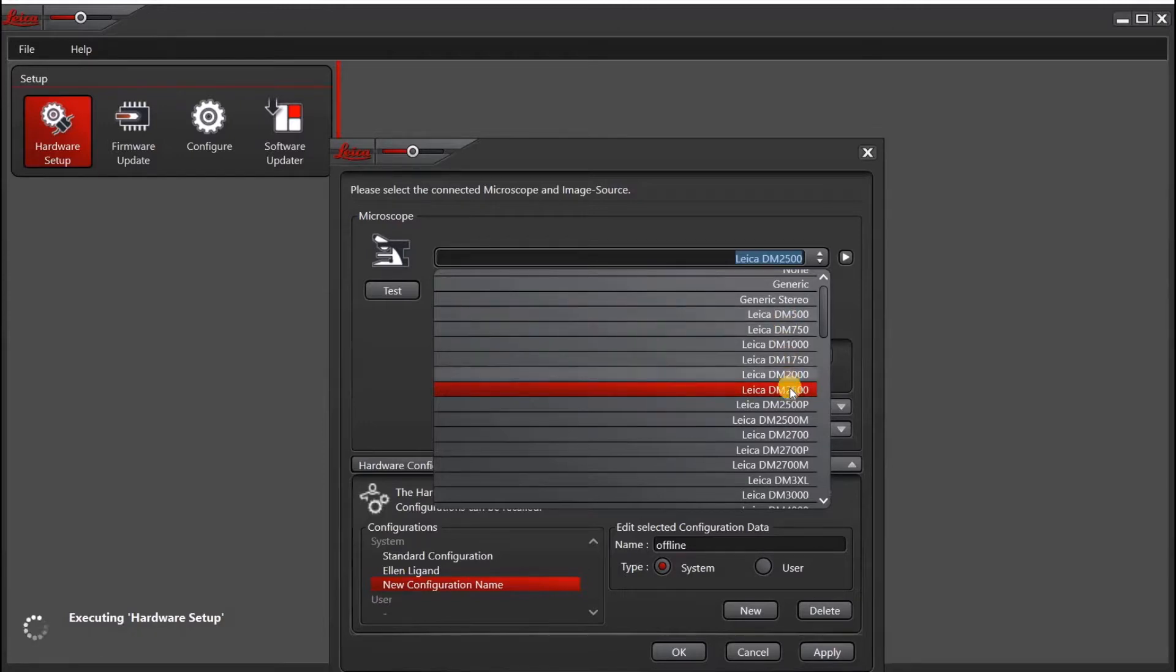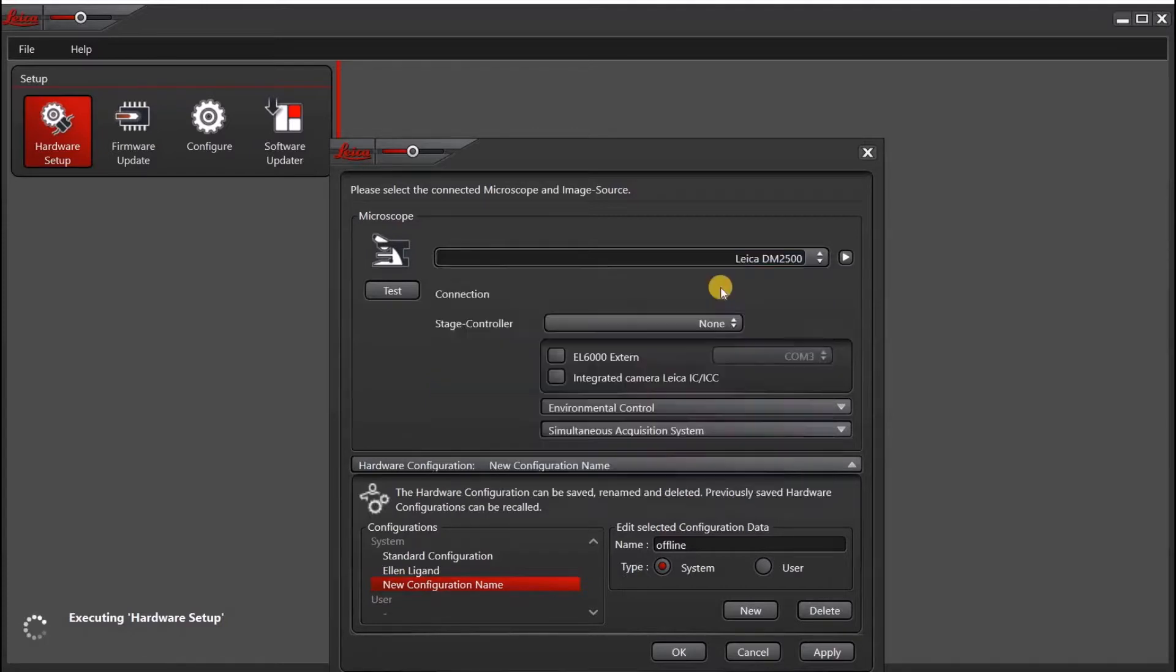Any of these DM microscopes should work up to the 2500 because they do not require a USB connection. So I will select the DM-2500.